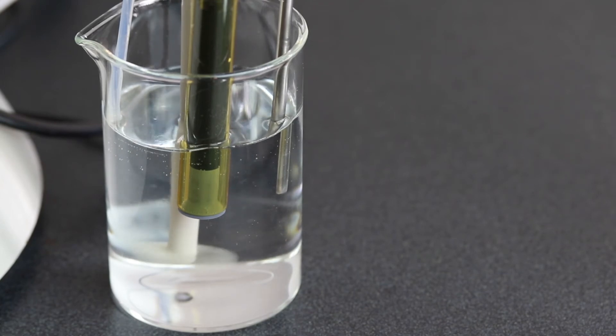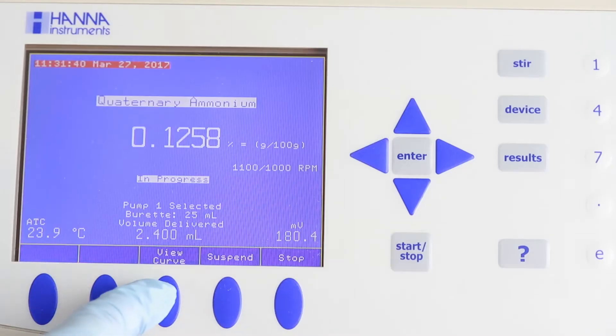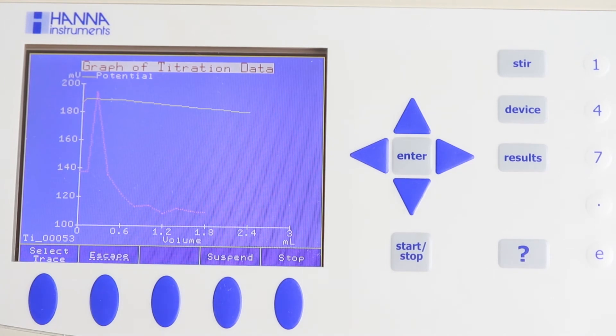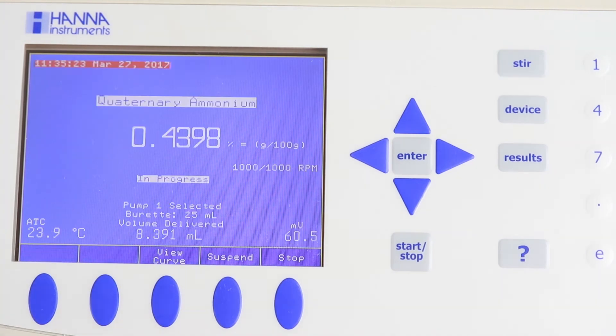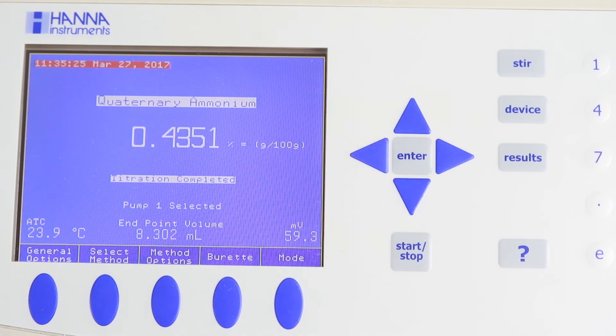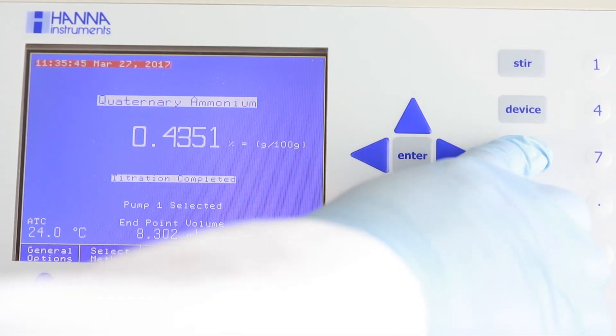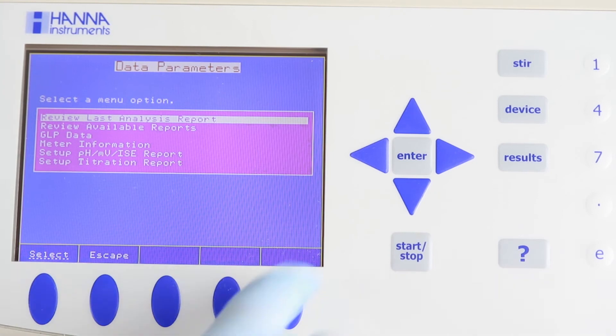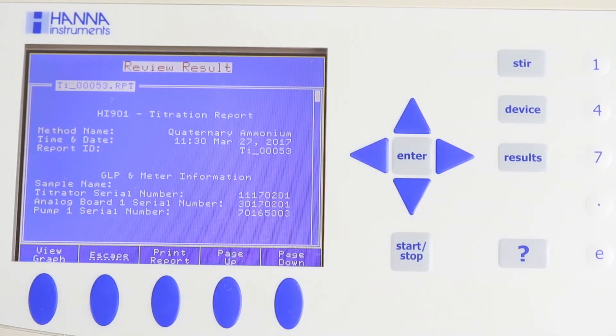While the titration runs, we can view a real-time graph as the titration progresses and also a running tally of our results. And now, our titration is complete. A full titration report is automatically generated each time and can be transferred onto a USB drive or PC.